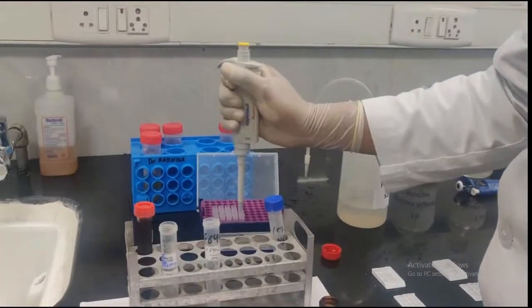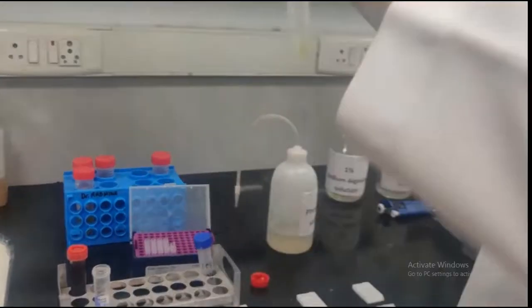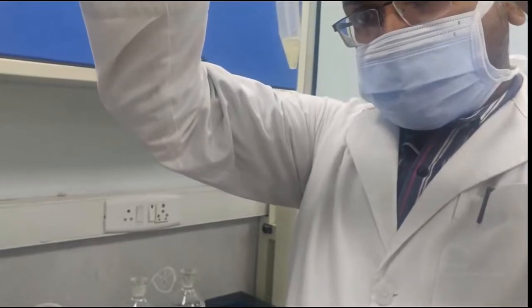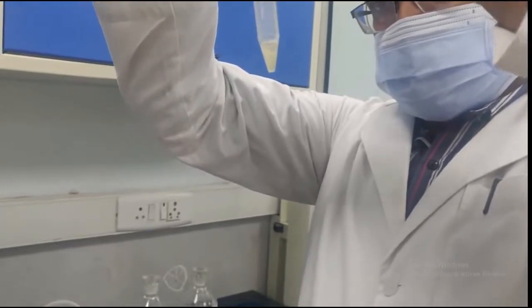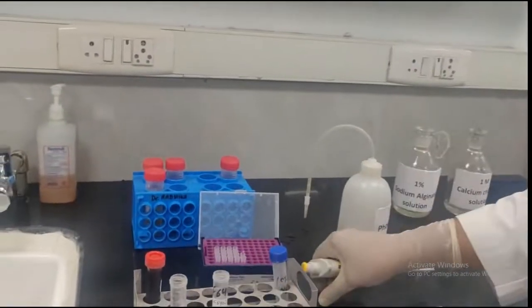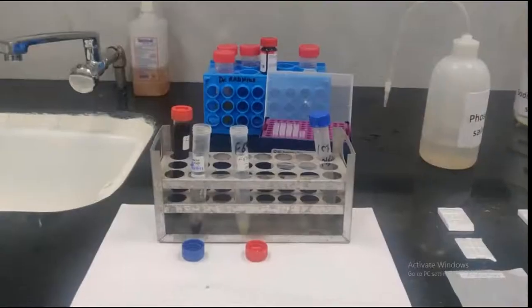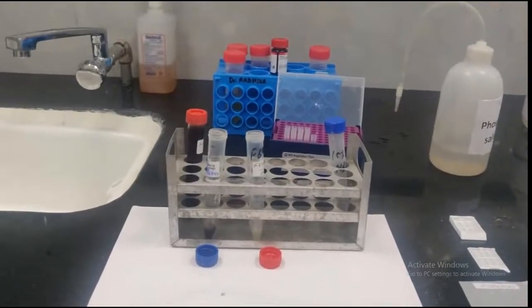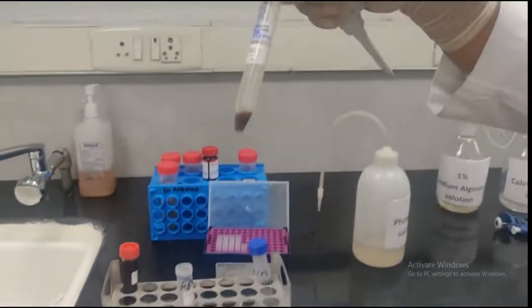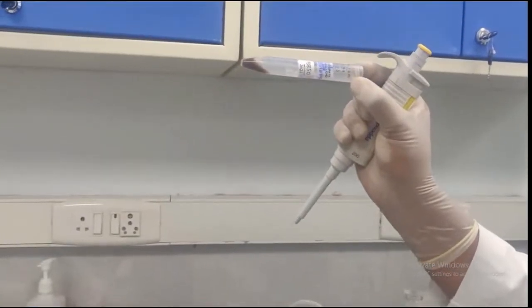Similarly, for the next sample, 50 microliter of thrombin will be taken and added into the tube. Ensure proper mixing of thrombin and plasma, and we'll keep the tubes, and within a few seconds a clot will be formed. Now we'll take these tubes and we will show you the clot. Can you please tilt the tube? Now we can see that a nice clot has formed at the bottom.